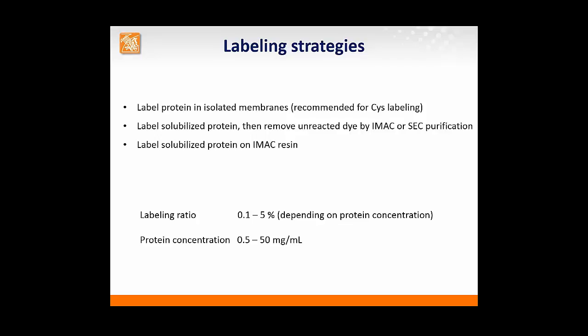And the last strategy is sort of a modification of the second, when you label your protein during the purification. So when the protein is bound, for example, on the affinity chromatography resin, you can label and purify at the same time.